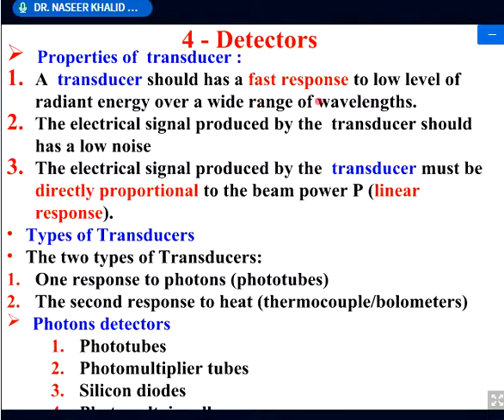So it should have a wide range. It doesn't mean that this is a transducer that is being used for 1500, and then we have to change. No, that should have a wide range. The response should be for the wide range of wavelength.